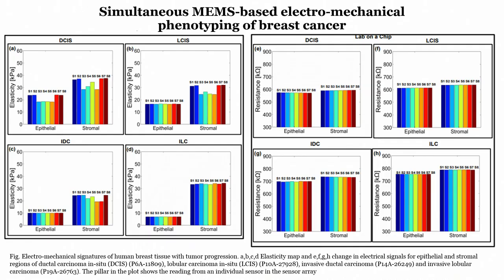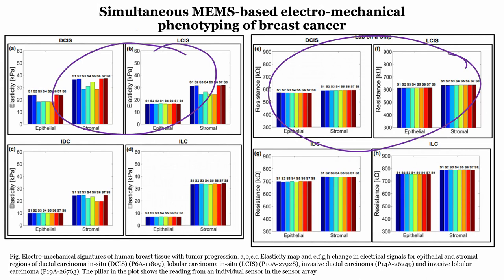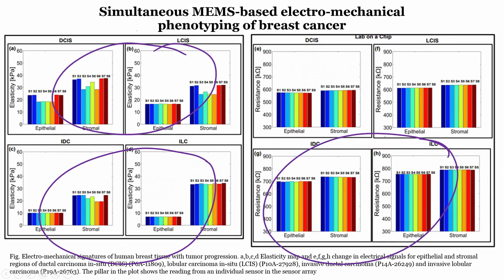If you see further and you compare the DCIS, that is ductal carcinoma in situ, versus LCIS, which is lobular carcinoma in situ, still you can see a very clear difference in epithelial and stromal region in case of elasticity as well as in case of resistance. These are resistance values, these are elasticity values. When you talk about IDC versus ILC, invasive ductal carcinoma versus invasive lobular carcinoma, also you can see a significant difference between the elasticity value in epithelial and stromal region, as well as when you talk about IDC versus ILC in terms of resistance, then also you can see a clear demarcation between the two values, right.